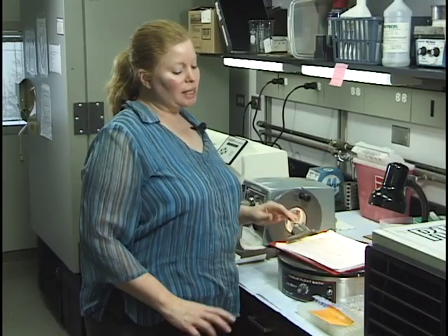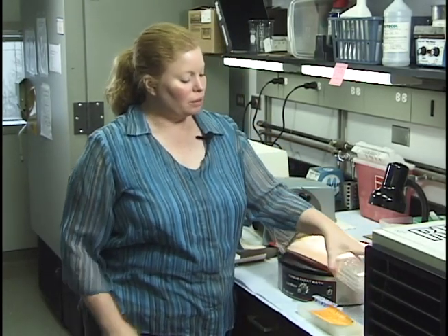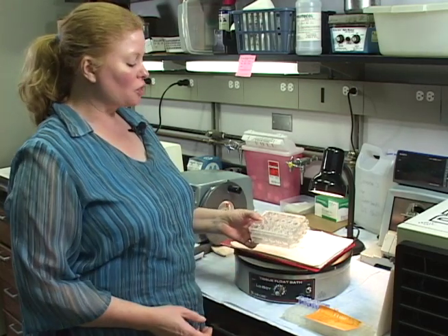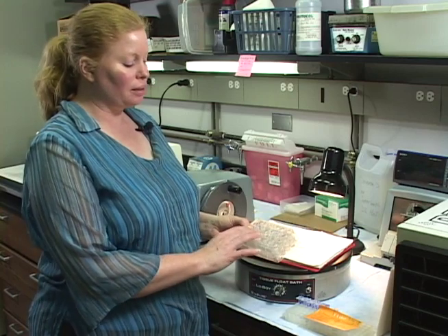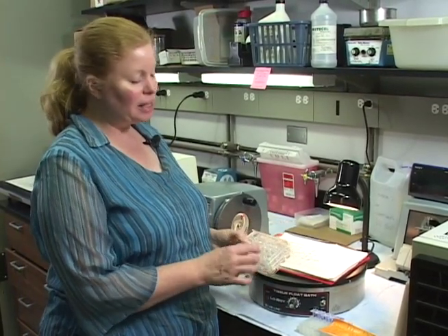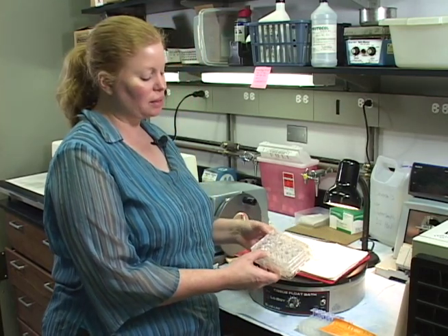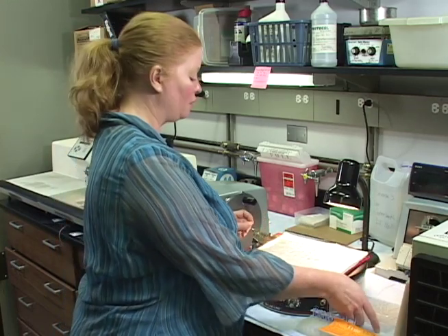The very first thing you would do before processing, obviously, is we receive our samples. Dr. Chin and Dr. Hong have started using these cell culture boxes, or these specimen culture things, because it's been easier to get the samples out without damaging your epidermal equivalents, the cell layers, through the meniscus of the liquid fixative.